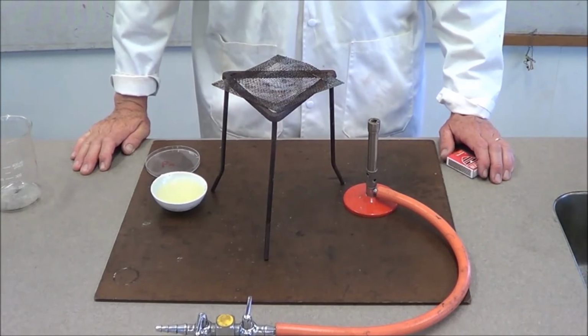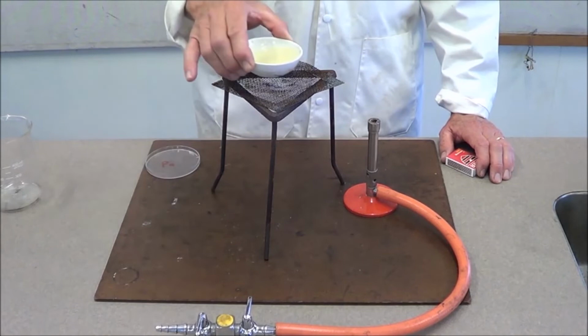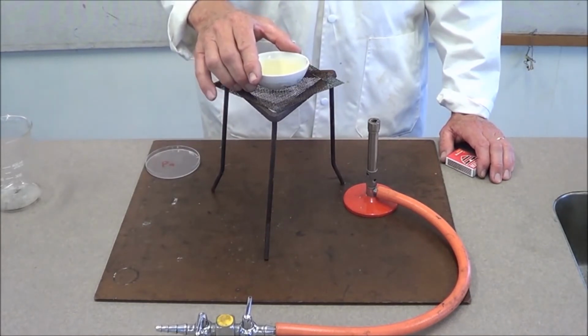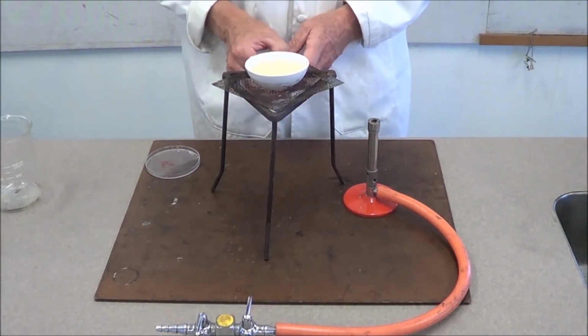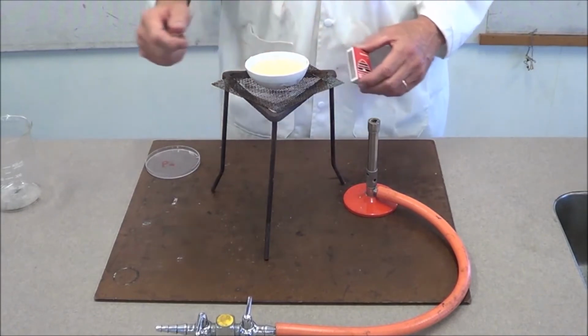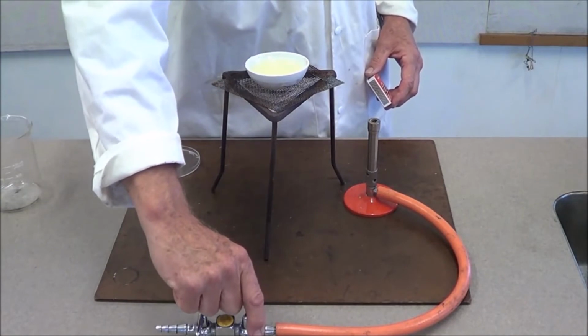To get a solid sample of our salt, we place our reaction mixture into an evaporating dish and put it over the heat and boil it for approximately a minute just to reduce the amount of water in there. We then leave it to cool over the next few days for the salt to crystallise.